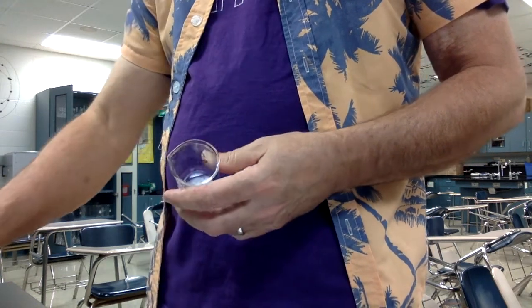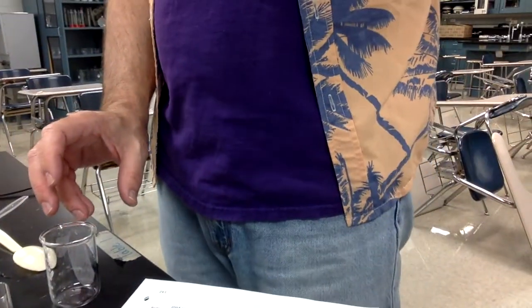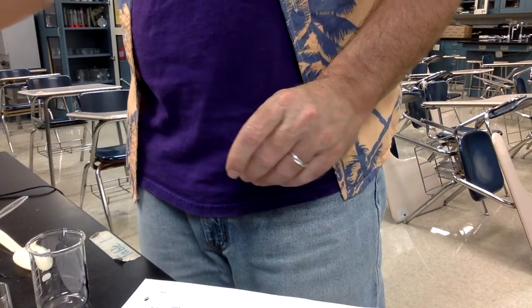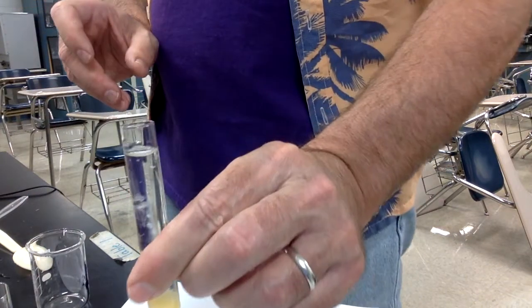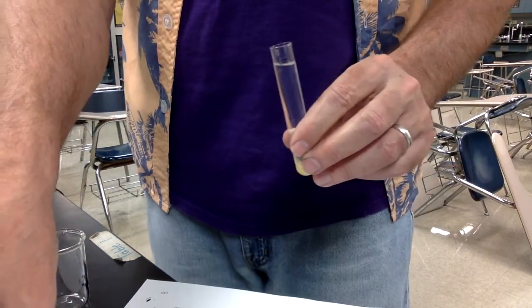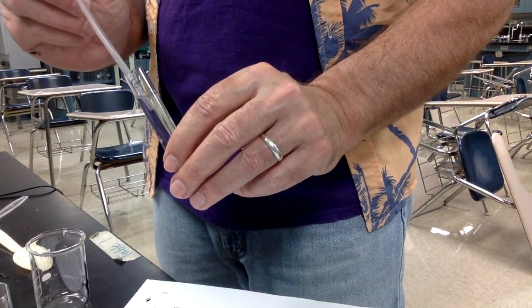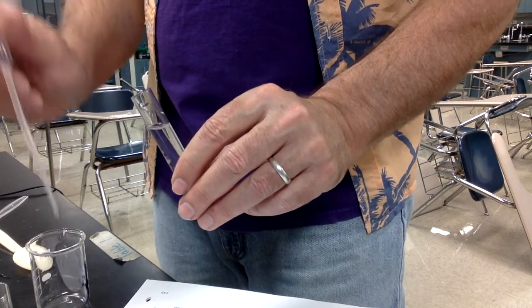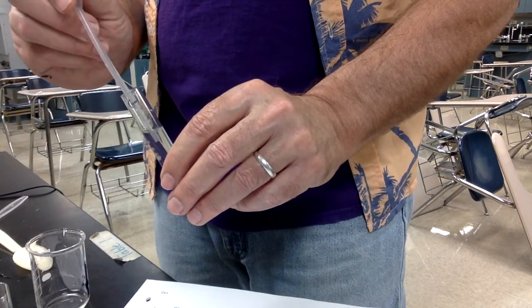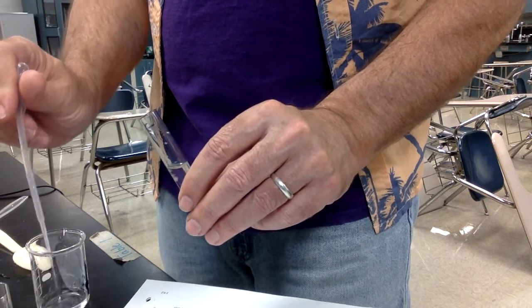So we're going to see how much glucose we extracted from that banana. So make sure I get my letters right. This is the green banana. And I'm going to try to get that liquid, that glucose-filled liquid, separated over here into this beaker.